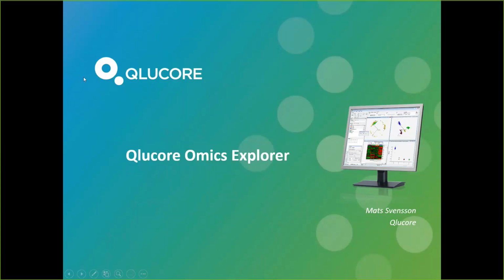Today's webinar is going to be a very, very simple introduction to some of our plots and what you can do with our software. And I'll start with a very short presentation of Qlucore as a company and what we're doing.